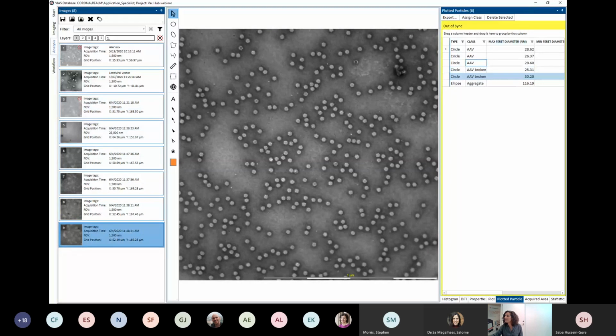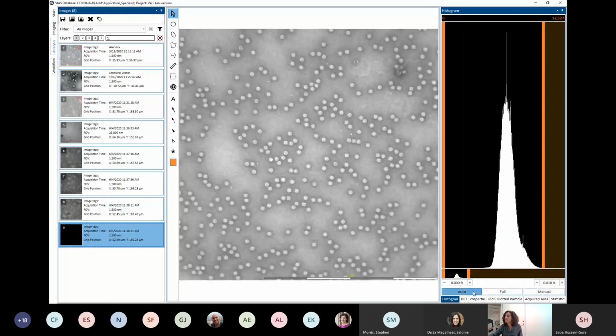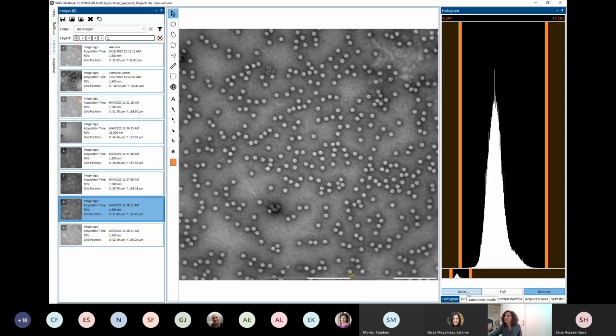One sec, Emily, I'm trying to make sure that you guys can see this in the best way possible. So there we go. And these are the images.